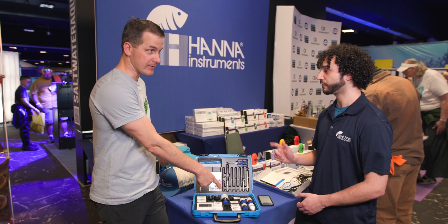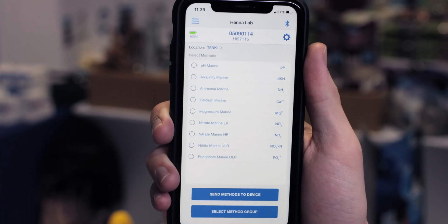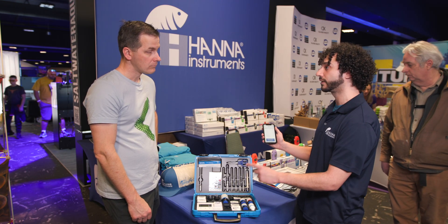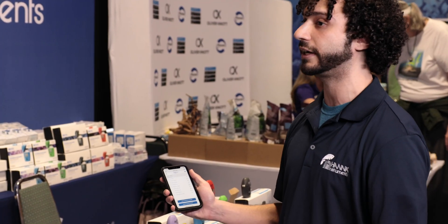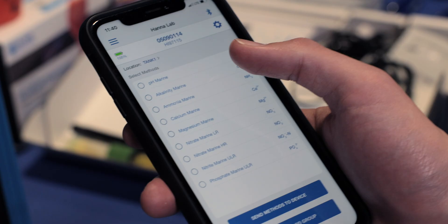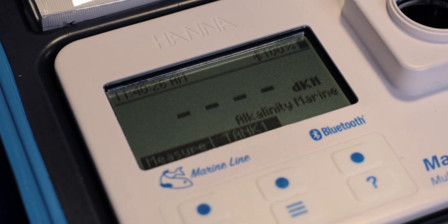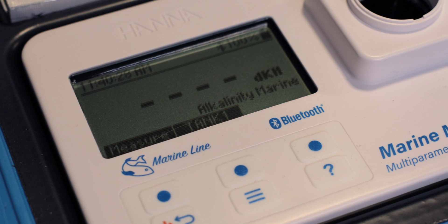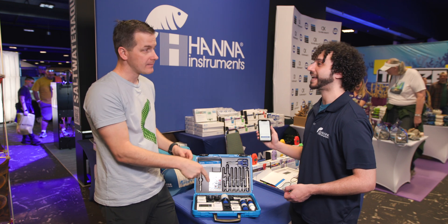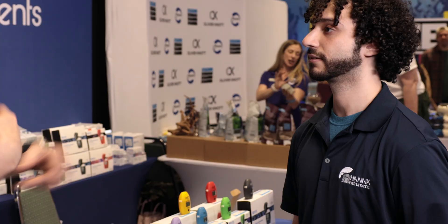It goes to your phone via the Hanna Lab app, and it's compatible both ways. Not only can you send data from the device to your phone, but if you want to test alkalinity, calcium, and magnesium in that order, you can select those on the phone, hit 'send methods to device,' and now the device is ready to test those parameters in that order. It runs the test, logs it, and moves on to the next test automatically.